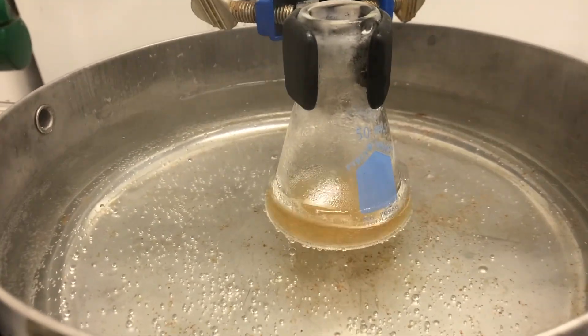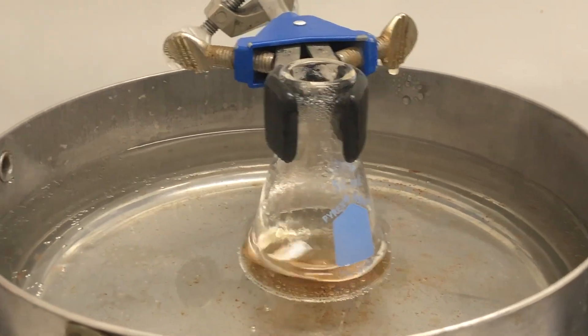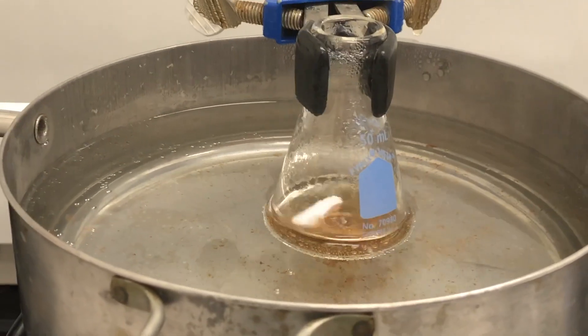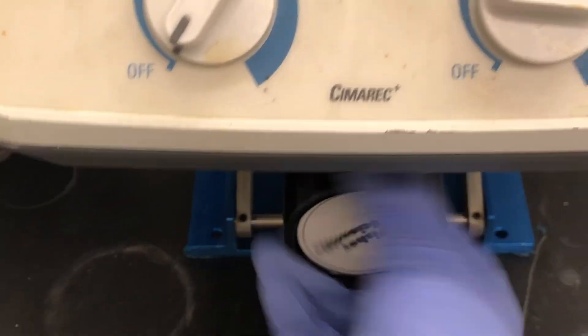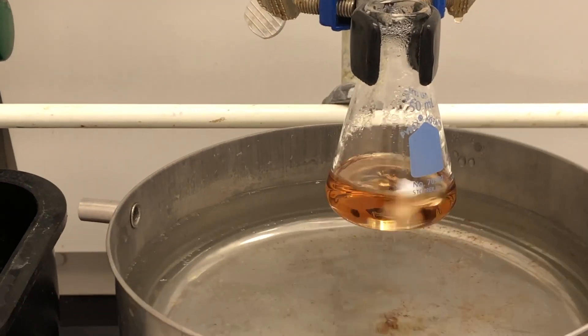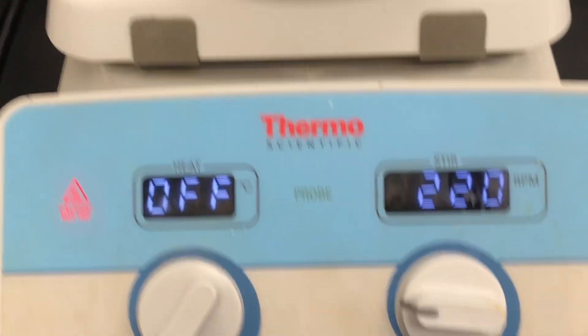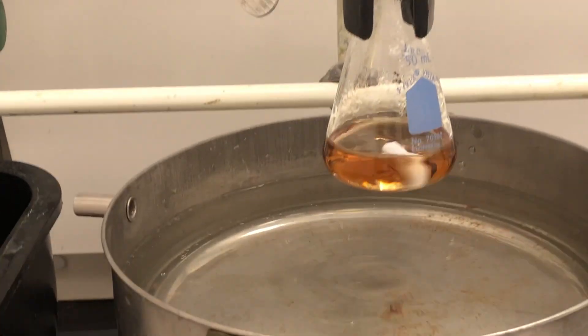Now, once I've let it sit in the hot water bath for about five minutes, I'm going to go ahead and turn off the heat source as well as lower the jack, basically removing it from the heat source. Notice the stir bar is still on, so I'll turn it off right now.